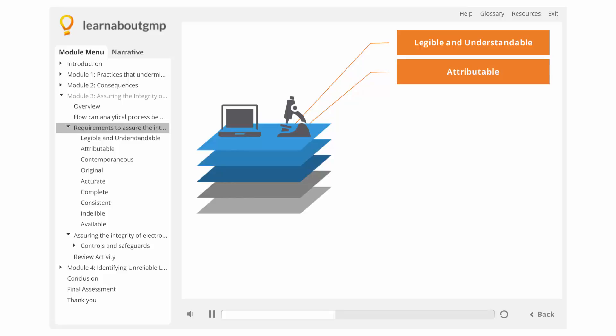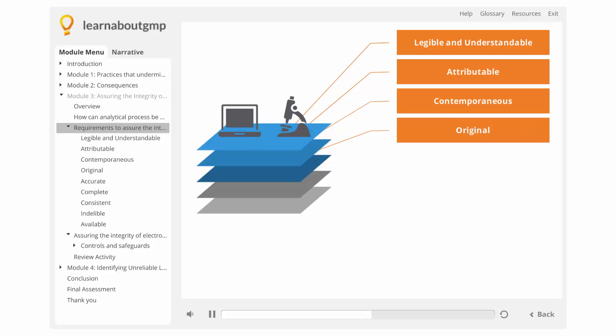Attributable. Who made the record or created the data, and when? The record must be made at the time the activity was performed. The information must not be written on a post-it, piece of scrap paper, sleeve of a lab coat, etc., and then transcribed.